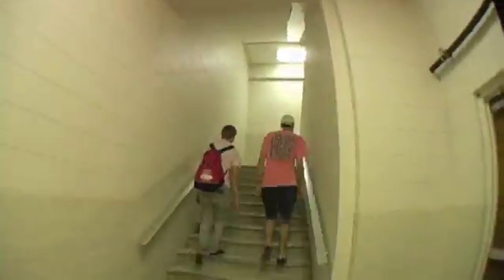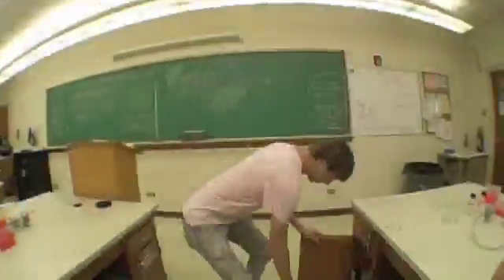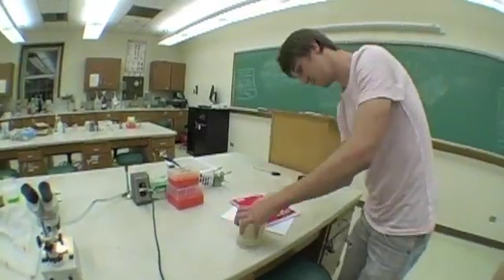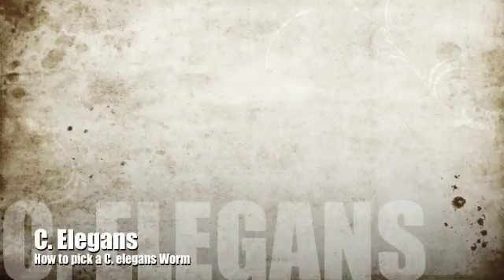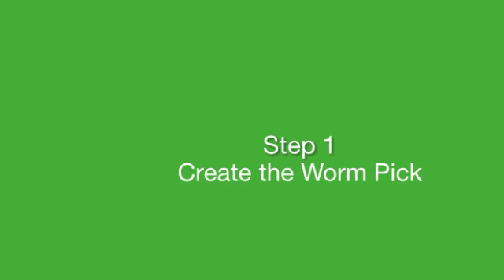In this instructional video we will show you how to create a worm pick and how to use it to move the model organism C. elegans from plate to plate. Creating the worm pick.